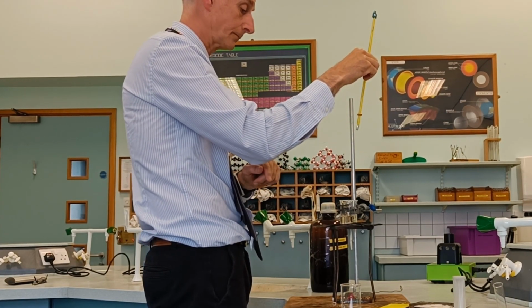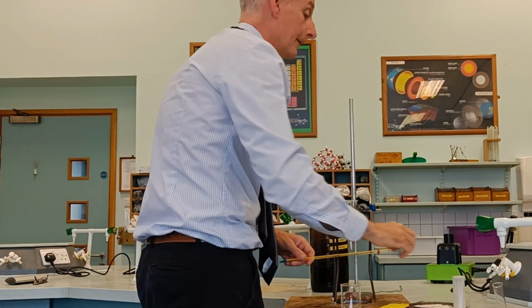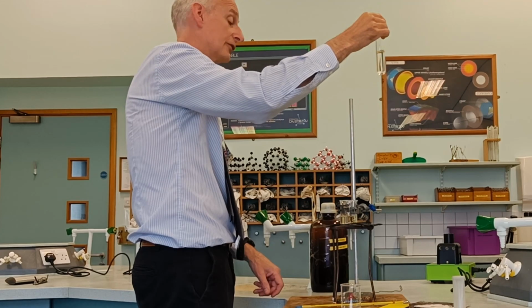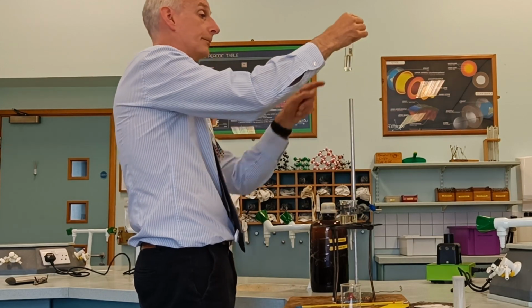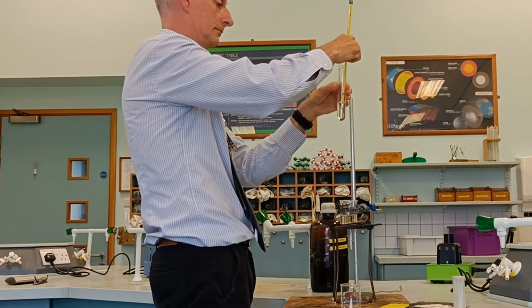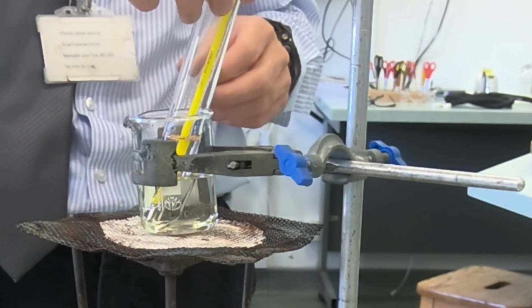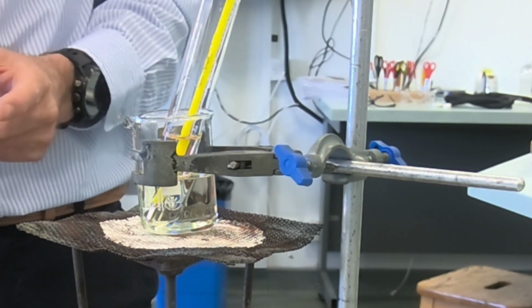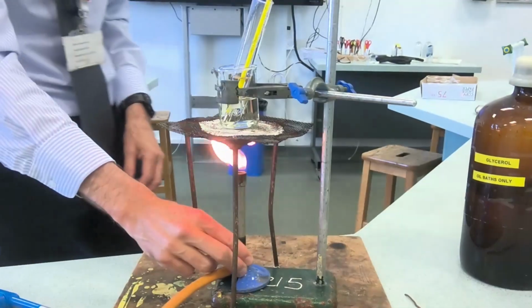Now I could put this directly into the mixture, but as a top tip, have an oil bath within an oil bath. So here's some more glycerol, probably a bit too much. There's some in here, and if I pop my thermometer into that, and then pop that into there, I'm going to heat it. So I need a Bunsen. Find me a Bunsen.